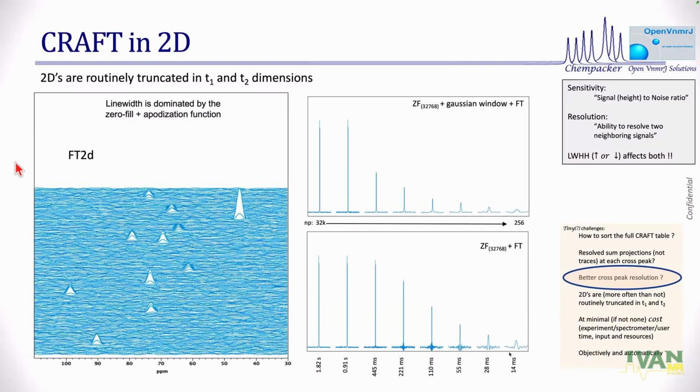But guess what? We are dealing in this area of loss in signal to noise. We go and buy a $100,000 probe that gives you 2,000 to 1 signal to noise on ethylbenzene, come back and do an HSQC and shoot ourselves in our foot. Because we need to deal with this. We have been living with this for a long time. I put a number on these. This is the sensitivity loss that we have had.